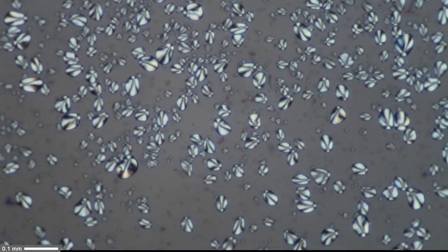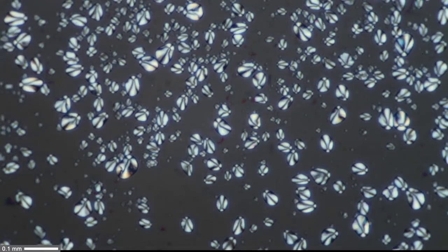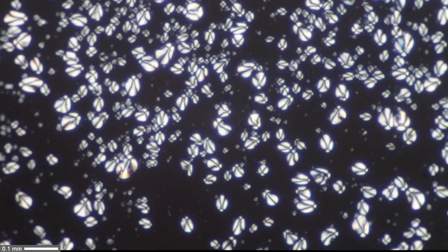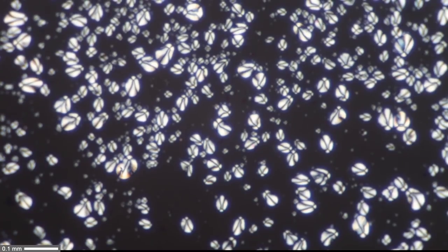At a higher magnification you can see that the starch grains have a very nice pattern. This cross-like pattern is very typical for polarizing substances. We can also see a similar pattern when we look at vitamin C and other crystals under polarized light.